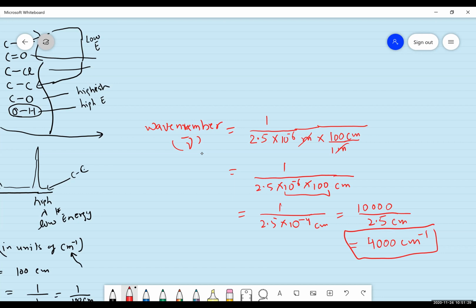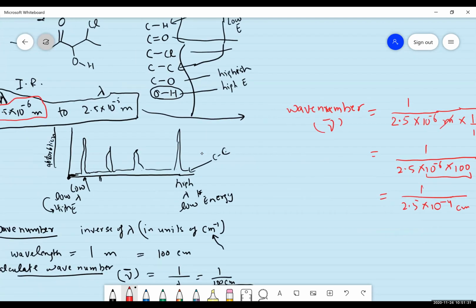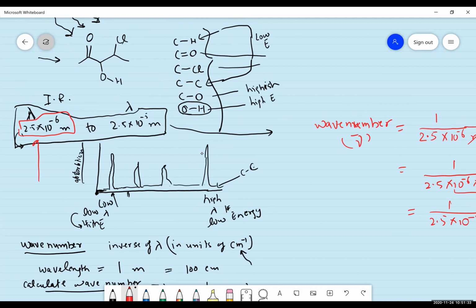Okay, so that's the highest wave number on this end.